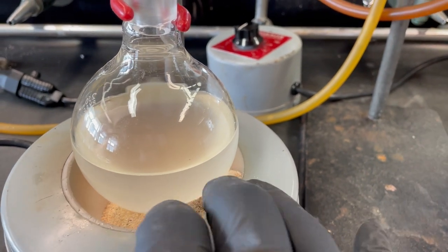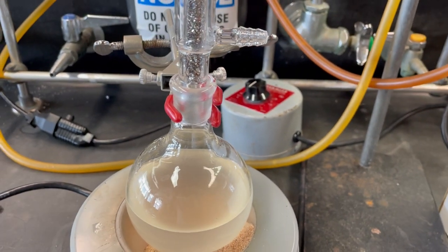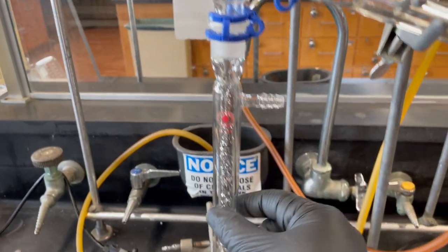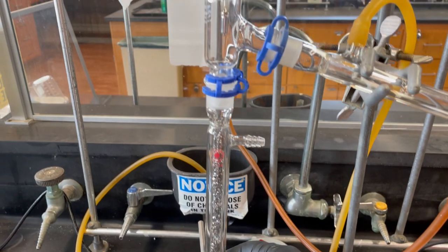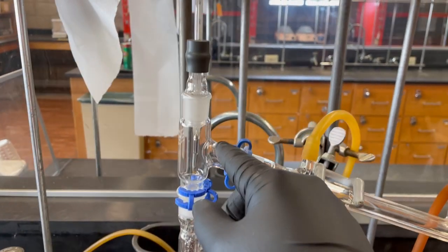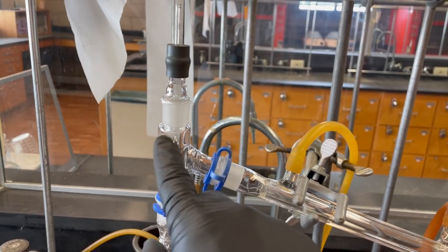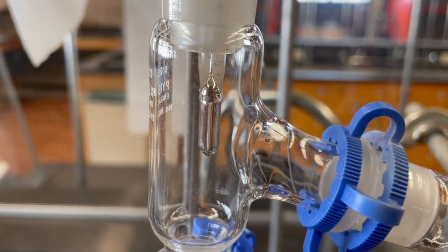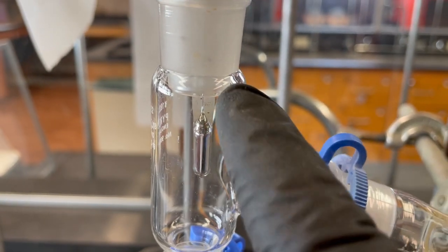You don't need to watch me do that forever, but what you can see is that this guy is connected to a column with that stainless steel sponge in there. Then it's attached to the distillation head. So notice it just goes up and over. Inside of there you can see the tip of a thermometer.